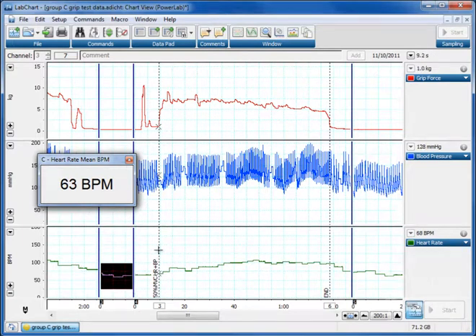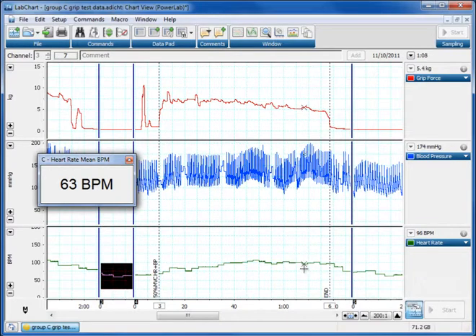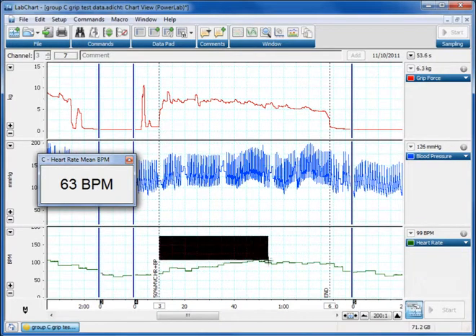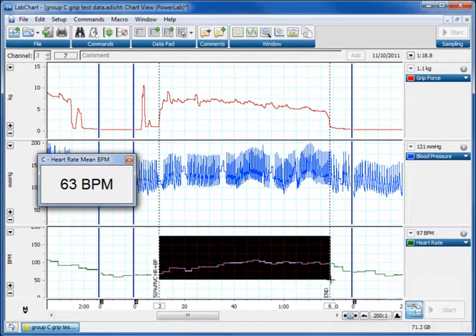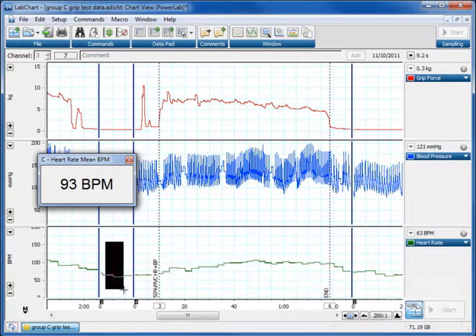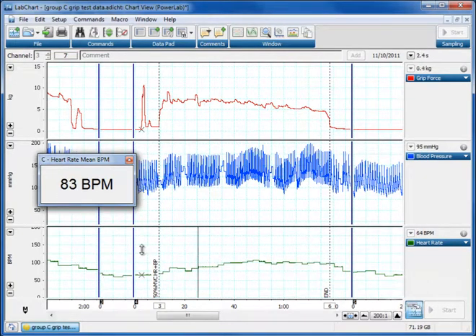So it's very easy then you could if you wanted to just write down these sort of mean numbers and if you're just doing single measurements like selecting all of this and going what is the mean or selecting all of this and what is the mean? Very quick and easy, very easy way of getting mean data.